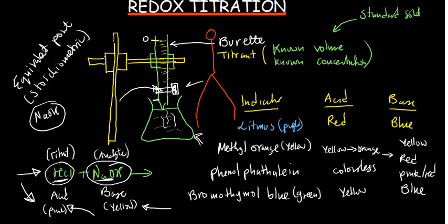You shouldn't clamp it so high that you are looking up at it. Because if whatever you're adding drops into your eye, it's going to corrode you and cause you harm. So make sure that it is at your height.